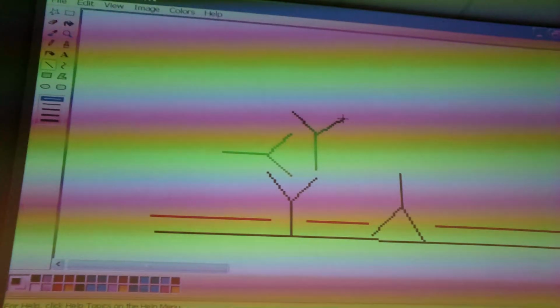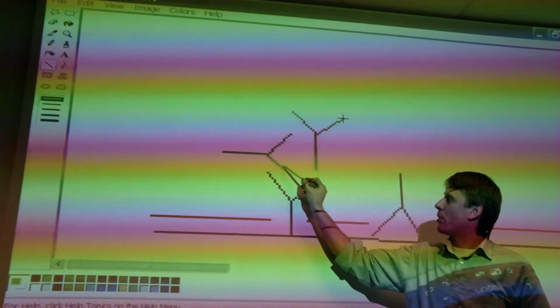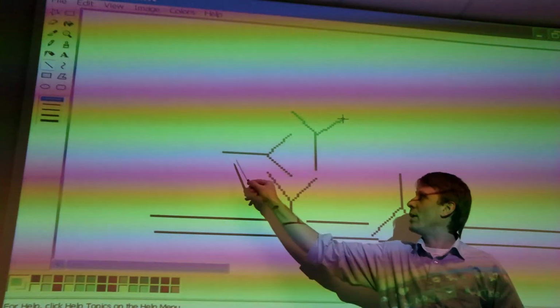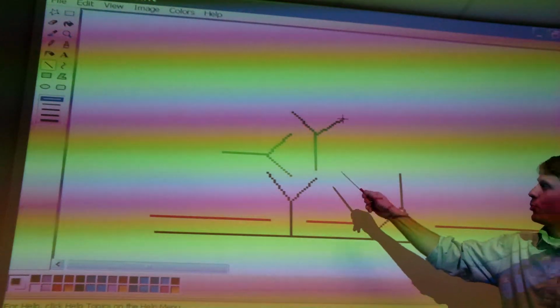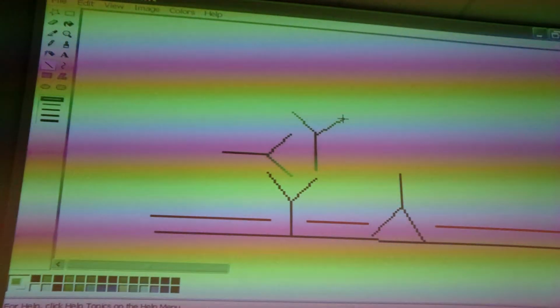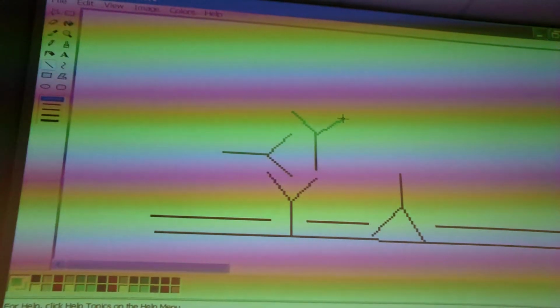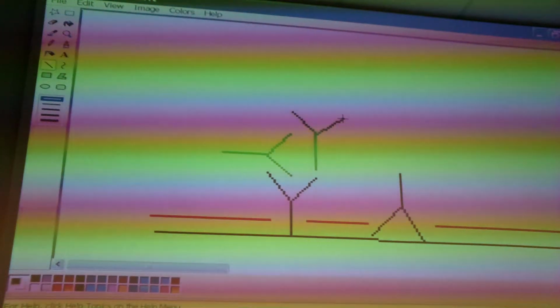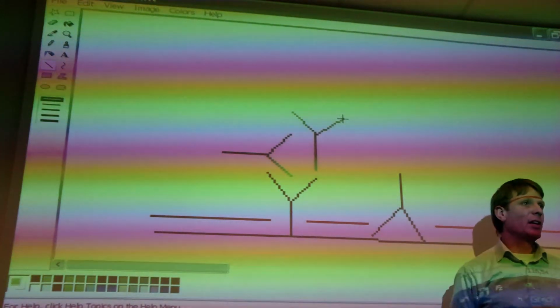That's the easiest way of doing it, because when you immunize, it's difficult to separate this part from this part. So typically what's used is papain, which will cleave it here, and then you can generate the FC part separately. That's a stable protein. It's difficult to produce a protein that contains all the constant domains of the IgG. So typically to obtain these secondary reagents, so secondary antibodies, they use the FC part for immunization of animals. Okay, but in this case we have bound our antibody with CH2 or CH1, so both are possible.